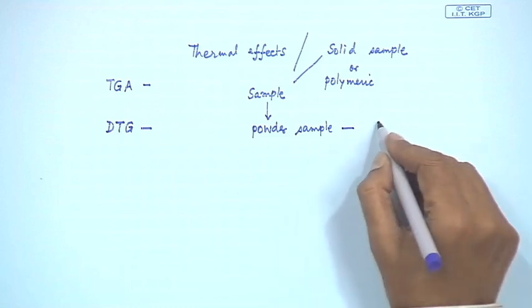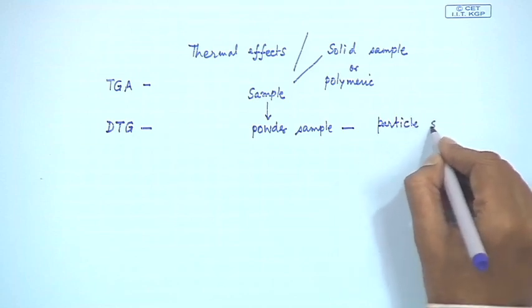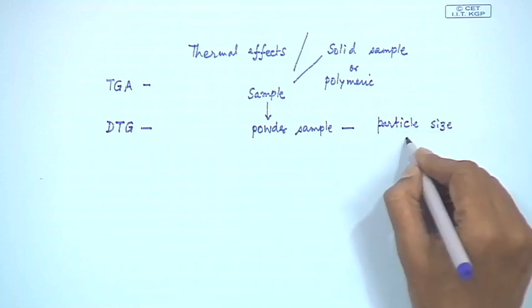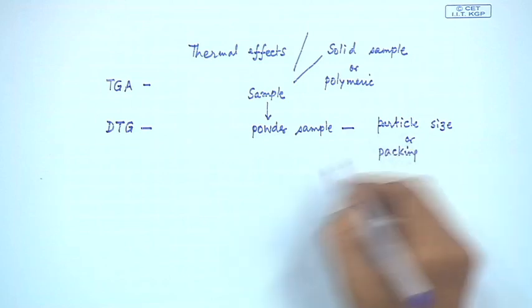So, the particles that are present and the type of packing, both are important.